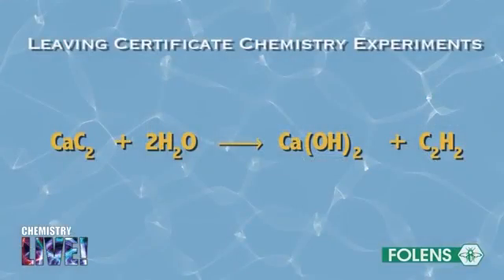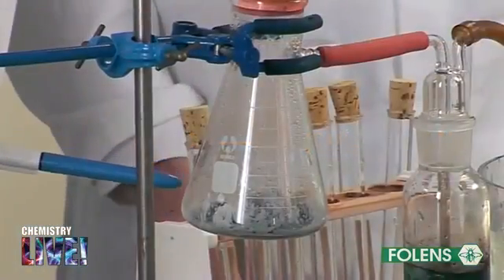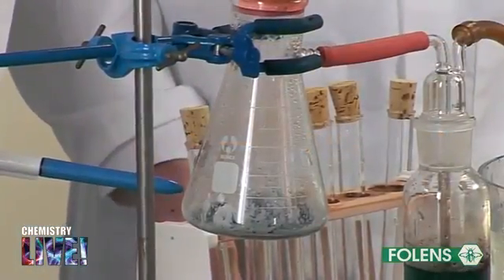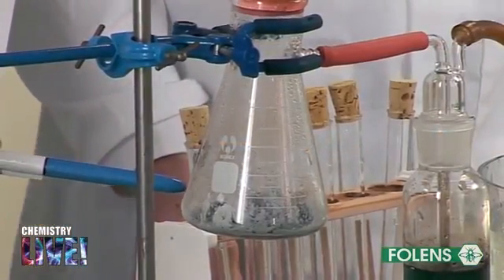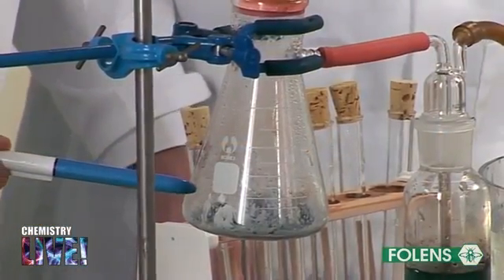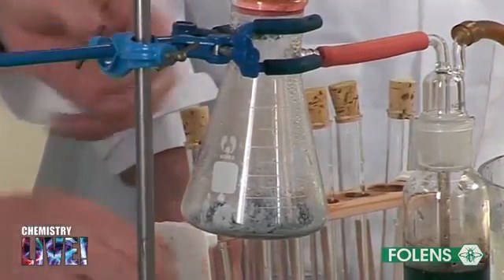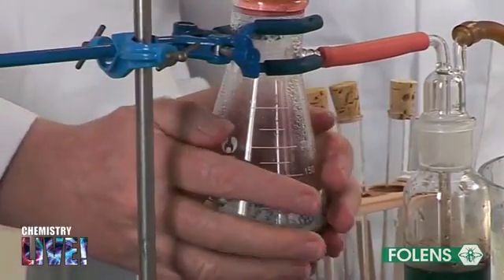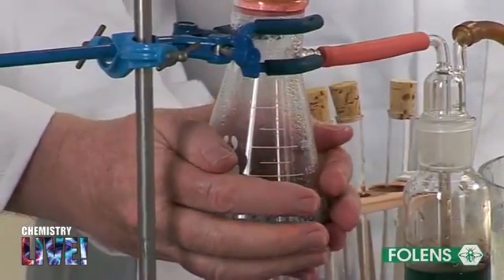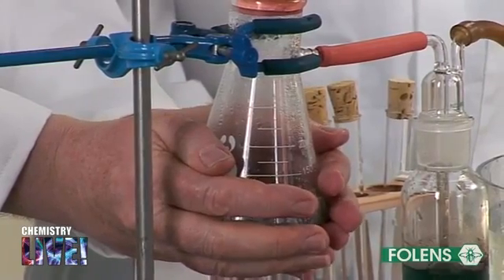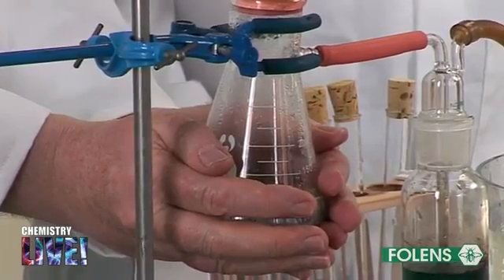The equation for the reaction is shown on the screen. Note the formation of white calcium hydroxide inside the flask. Place your hand on the outside of the flask. When you perform this experiment yourself, write down what you notice.